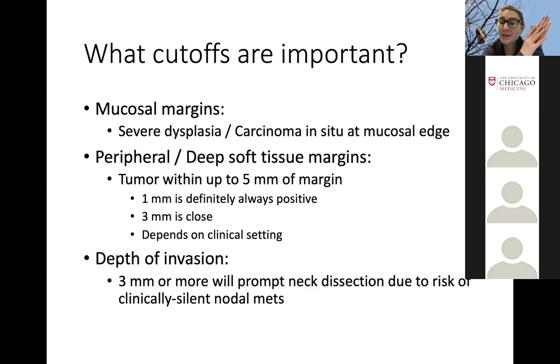Anything about 3 millimeters or so is kind of starting to be, do we take more, do we not? That's the surgeon's decision. And then anything 5 or more is generally grossly free and is fine. As I said, this depends on the patient, the physician, and the clinical setting, but those are the things we want to keep in mind for when and where to freeze and why it's important.